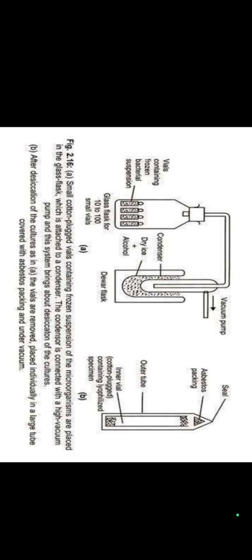Small cotton-plugged vials containing frozen suspension of the microorganisms are placed in a flask which is attached to a condenser. The condenser is connected to a high vacuum pump and this system brings about desiccation of cultures.